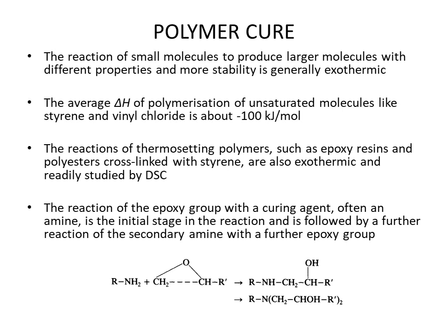The reaction of an epoxy group with a curing agent, and normally the curing agent is an amine, is the initial stage in the reaction and is followed by further reaction of the secondary amine with a further epoxy group. So here is the reaction of this curing agent with this epoxy group, and cross-linking is generated, and there is the phenomenon of curing of that polymer.